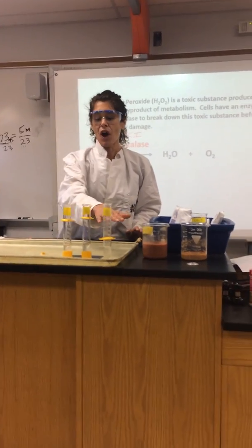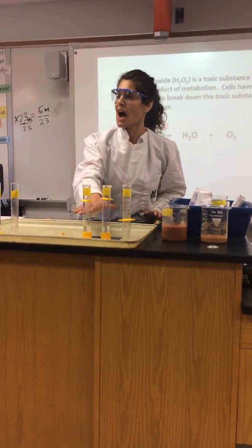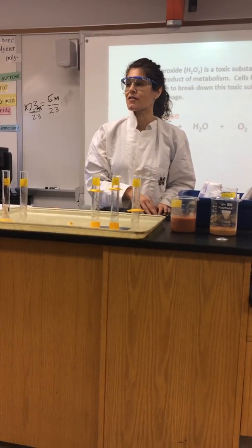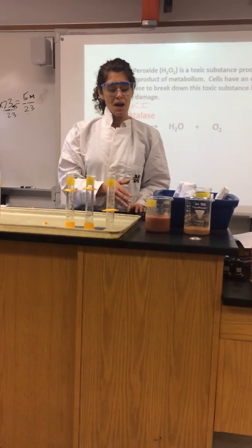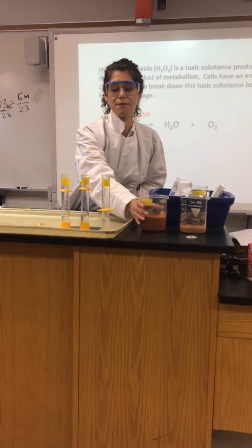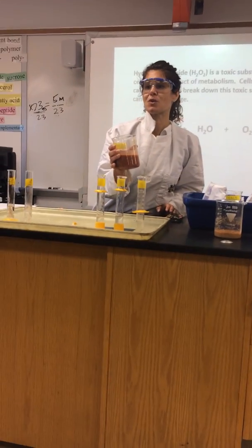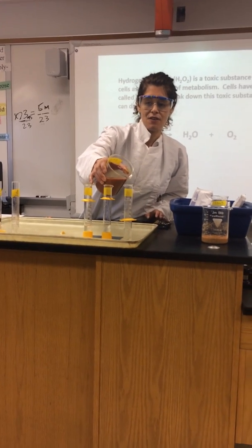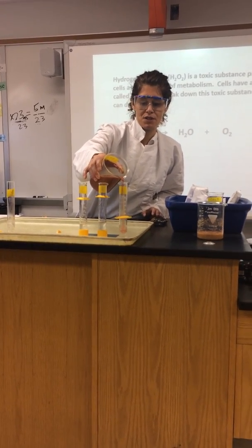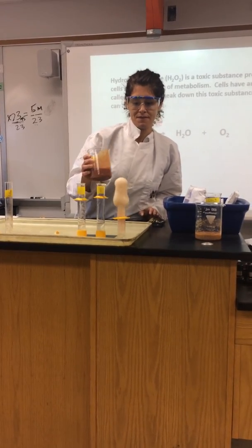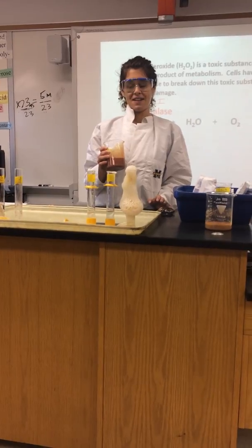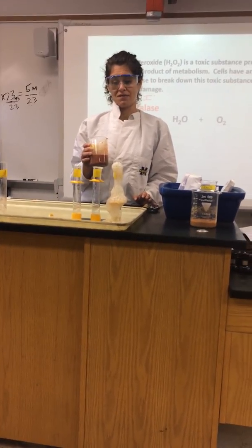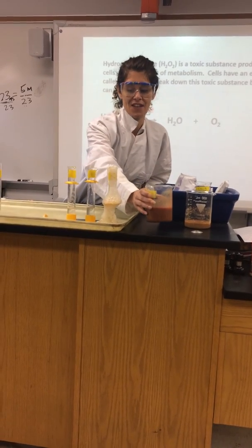I have already put in the hydrogen peroxide, and I'm just going to add my three types of liver: my room temperature, my boiled, and my cold. The first graduated cylinder, which is the first row in your data table, is the fresh liver at room temperature. That's a lot of bubbling, and it's actually smoking too — so that's a lot of reactivity.